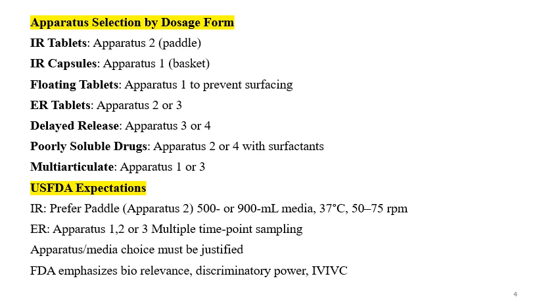Delayed release formulations can be tested with apparatus 3 or 4. Many of the time, apparatus 1 and 2 can be used. Poorly soluble drug formulations are tested using apparatus 2 or 4. Sometimes apparatus 3 is also used for non-disintegrating types of formulations. Multiparticulate systems can be tested with apparatus 1, 2 or 3.